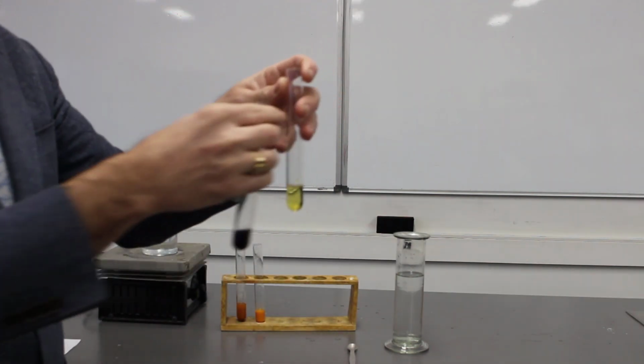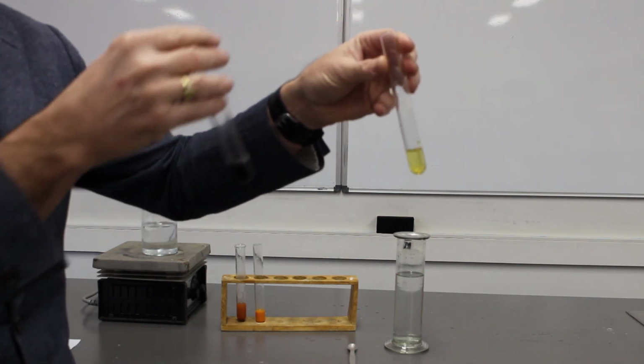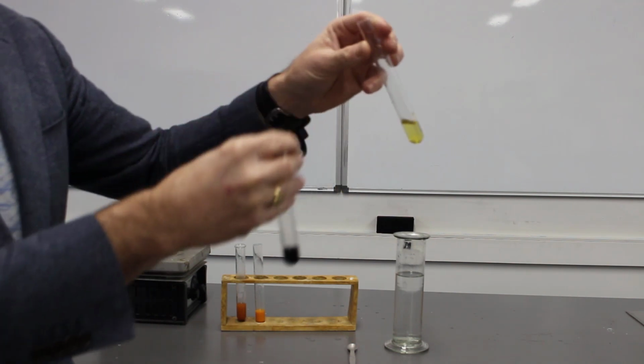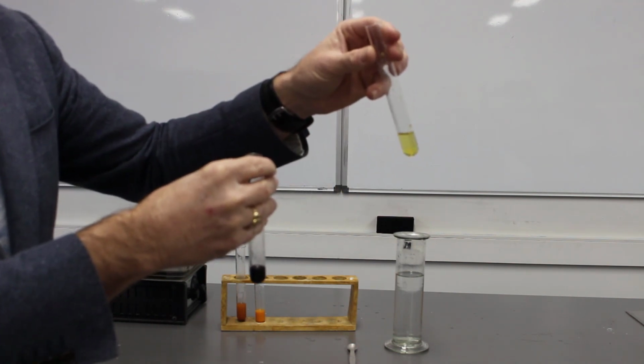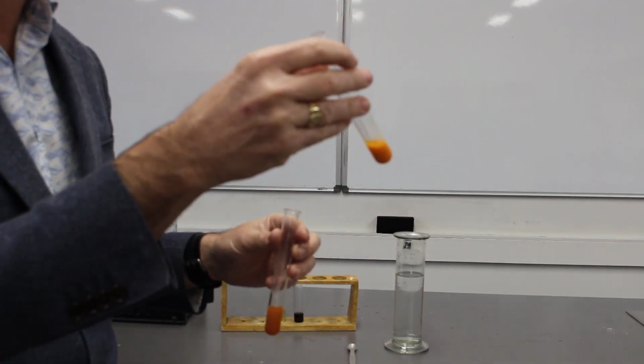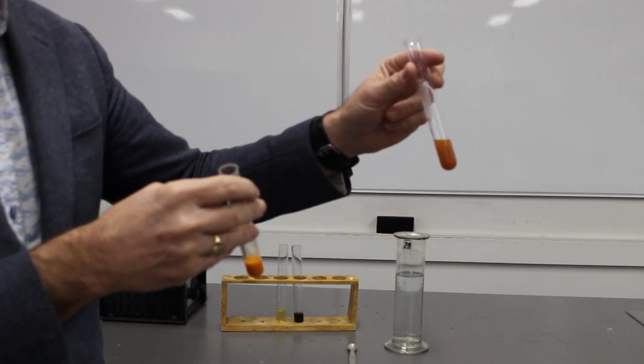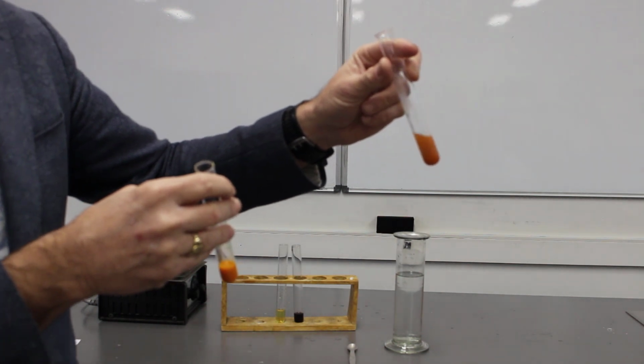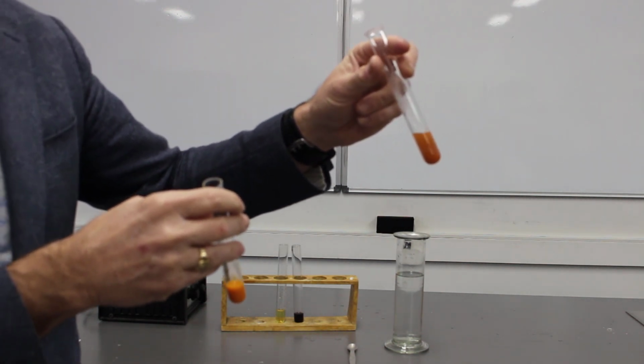Now, our starch test, outside the tube, inside the tube. So confirming still got starch inside the tube, but no starch got outside the tube. Still got glucose inside the tube, and glucose went outside the tube as well, through the small holes in the dialysis tubing by a process called diffusion.